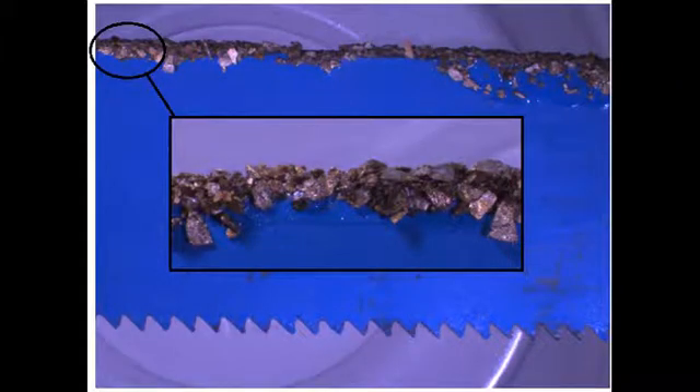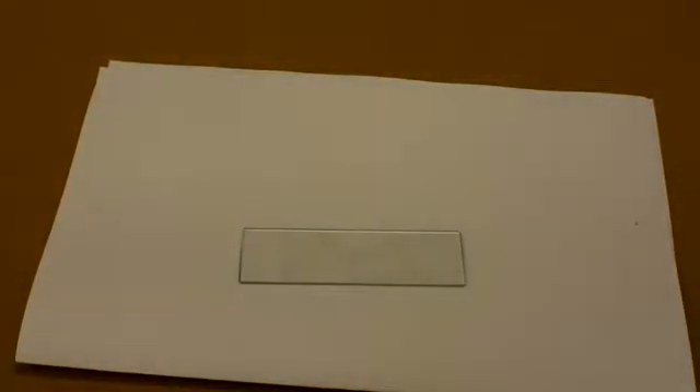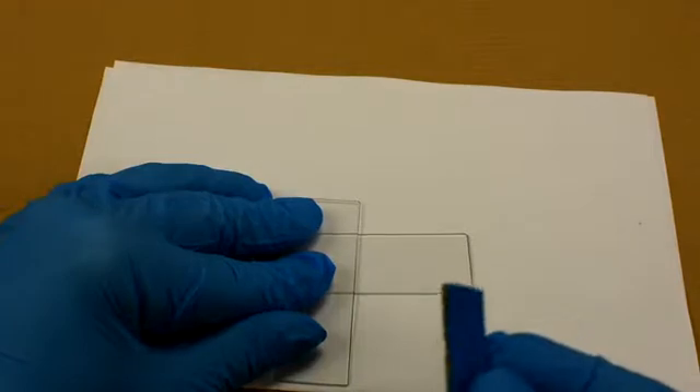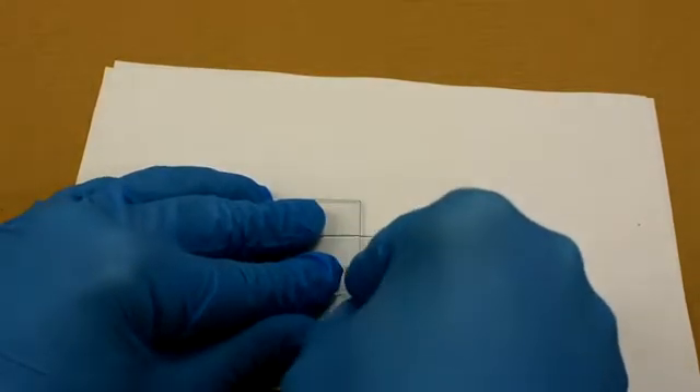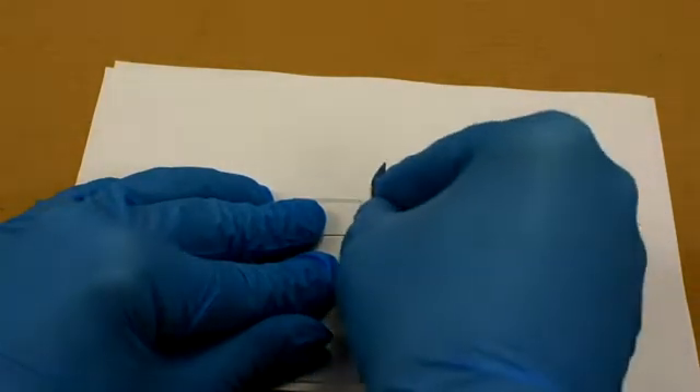To demonstrate the hardness of titanium nitride, we are going to use a piece of glass — a glass slide in this case. Using our titanium nitride on our hacksaw blade, we are gently going to scrape a few times along the glass slide, not pressing too hard as we have only used super glue to hold the titanium nitride in. With the glass scored, we now have a stress point, so it is very easy to fracture the glass along that surface.